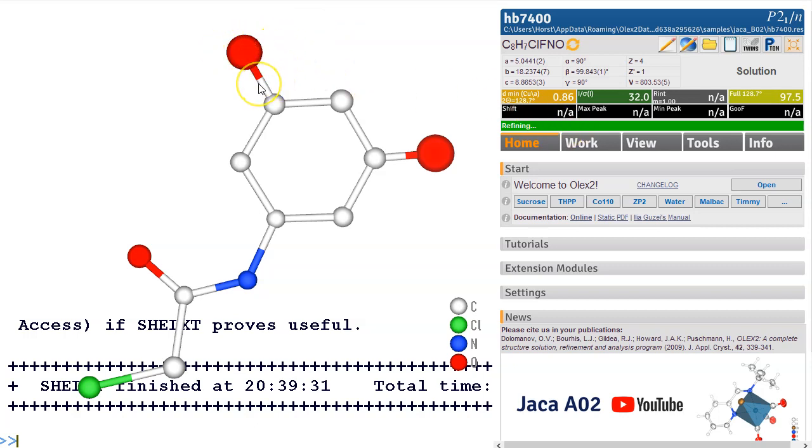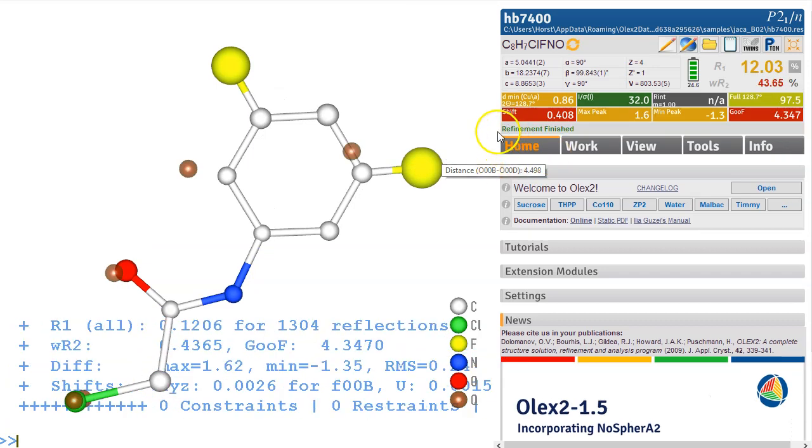I suspect, let's have a look at the distance, it's 1.258, it's not a carbon so I suspect these are both fluorine atoms. Name F. Let's refine this, so this is going to make it worse obviously because they're disordered over those two positions.